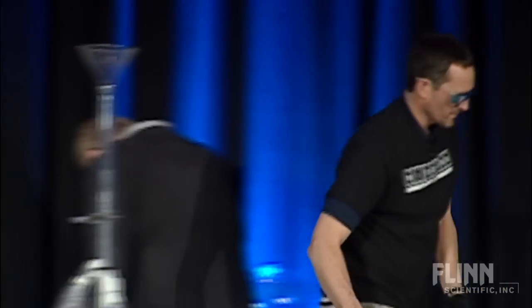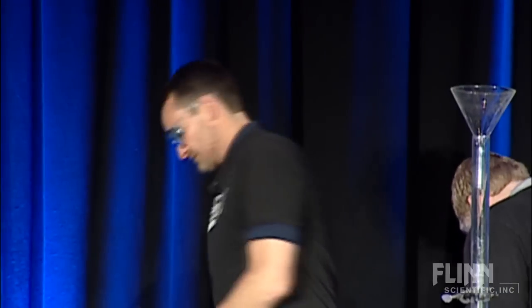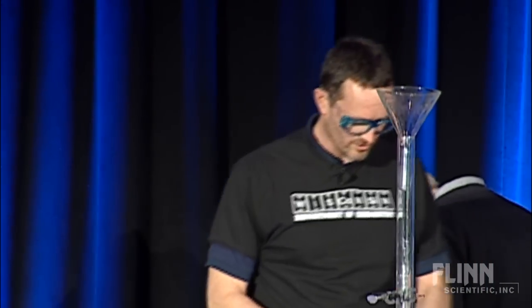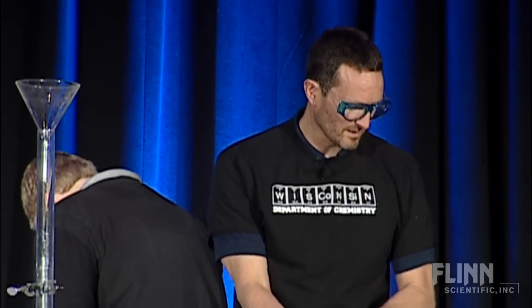The next demonstration is really one of my favorites — this rocked my world the first time I saw it. The credit, I think, goes to Jim and Julie Early out of New Jersey; that's who Flynn credits for this. It's a catalyst demonstration, and most of you are familiar with the elephant's toothpaste demonstration for catalysts — it goes all over the place. If you're not, Google elephant's toothpaste and you'll find it.